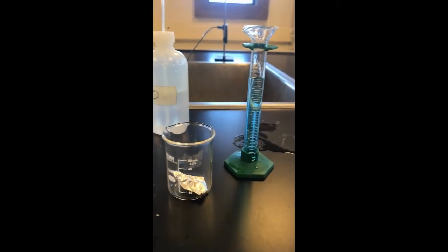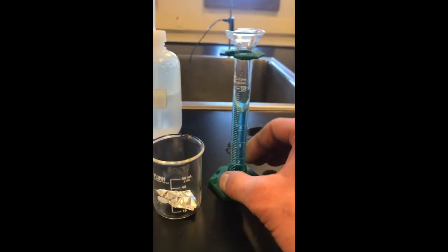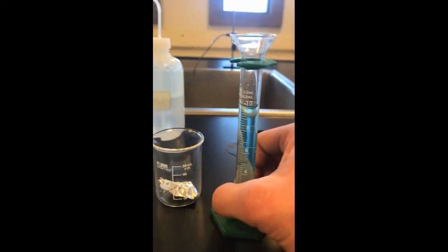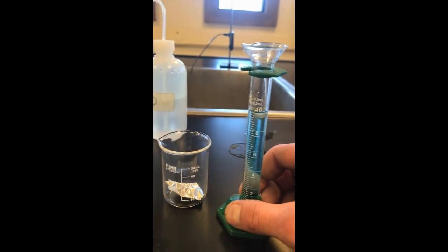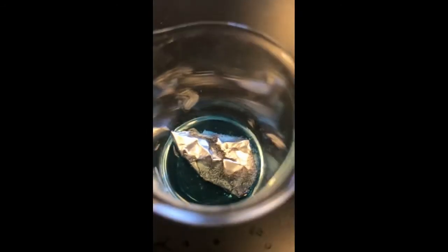All right, now that I have transferred the aluminum foil into my 50 milliliter beaker, I have taken the liberty already of measuring out our concentrated copper 2 chloride solution. And I am going to pour it in. What we should start seeing at one point in time is chemical reactions taking place. We should be seeing some bubbles. Color is changing. Let's come back later.